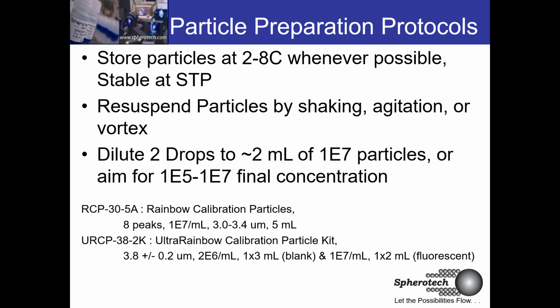And when you're getting our less precise particles that may come in higher percentages or higher concentrations, it's always good to dilute to about this level into a flow cytometer, not only so that your event rates are reasonable, but so that you don't end up cleaning it. If you put in very, very concentrated particles, they're much easier to visualize, but then potentially the next users or the flow core staff are going to have to spend quite a bit of time cleaning that instrument. So we want to make sure that our particles are present, but not too concentrated.